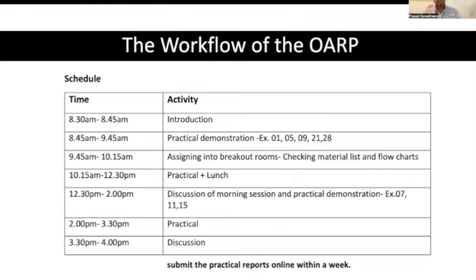The workflow of the OARP session was like this. We started at 8:30, and there was an introduction, and then the practical demonstration was conducted. After that, we assigned them into breakout rooms, and we checked whether all materials were there and flowcharts were drawn. Both are mandatory because they indicate their preparation. And we had discussions in the afternoon and evening.